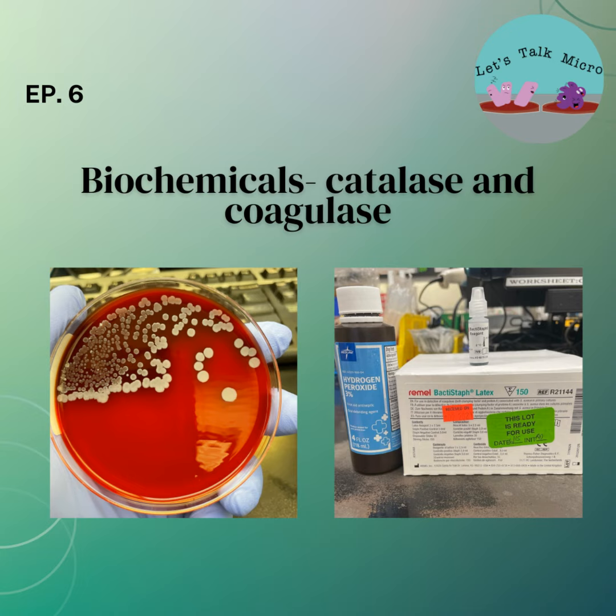And I've been shown that you do it for 2 hours, make it heavy, and you can see movement. You want to see forward movement across your field of view, and that's considered motile. Once you see that, you can report your culture as bacillus species, not anthracis. If your bacillus was beta hemolytic, then there's no need to do the motility because bacillus anthracis is non-hemolytic.